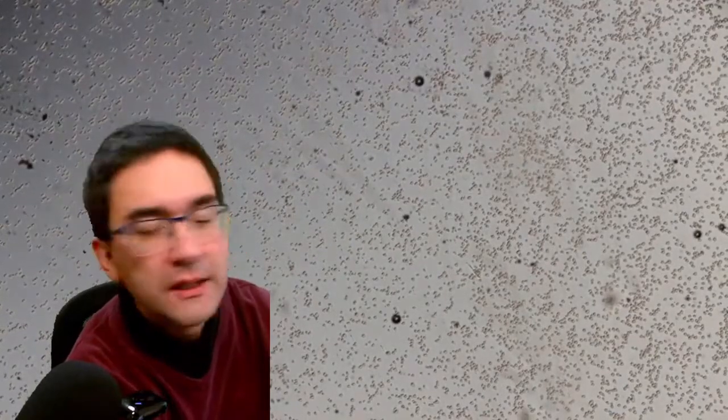Microscope viewers. Now I need to turn up the light a little bit. Let's start off with the spores. Let's see. Here we go. I might have to refocus a little bit. And it's now using the 10 times objective, some occasional air bubbles in there. Look at this.